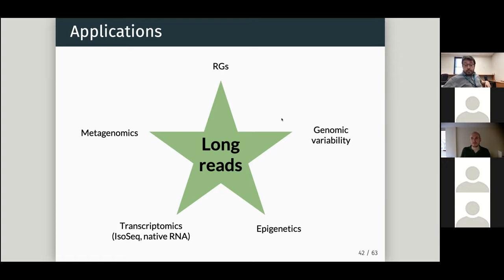Soon, I think we should be able to do that. And you should be able to quantify every isoform. Here again, throughput means cost of the sequence, because you can always sequence at any cost. The problem is that your experiment is going to cost just too much.